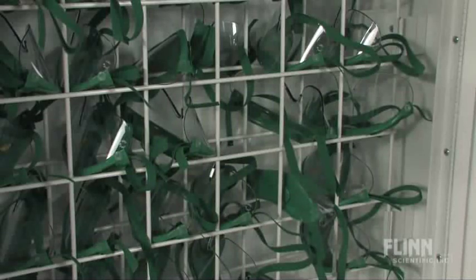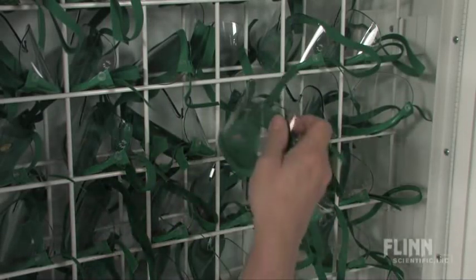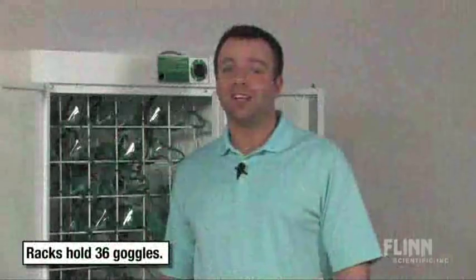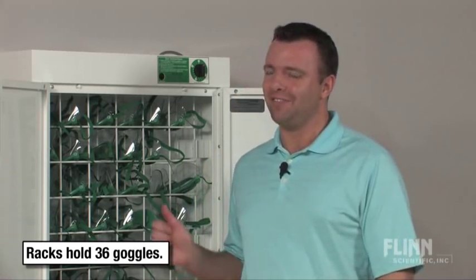The cabinet of this unit is made out of 24-gauge steel, so it will stand up to years of punishment in your classroom. The Flynn Goggle Sanitizer will make sure your students not only have a sterilized pair of goggles, but will also give you a convenient place to store them.